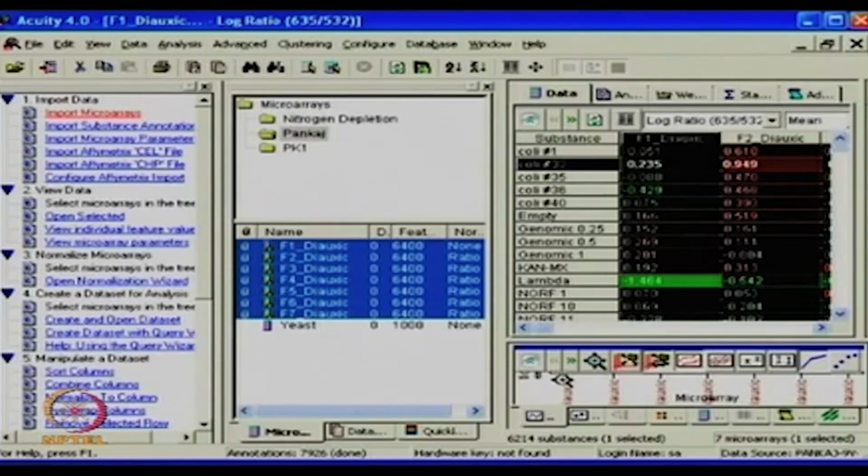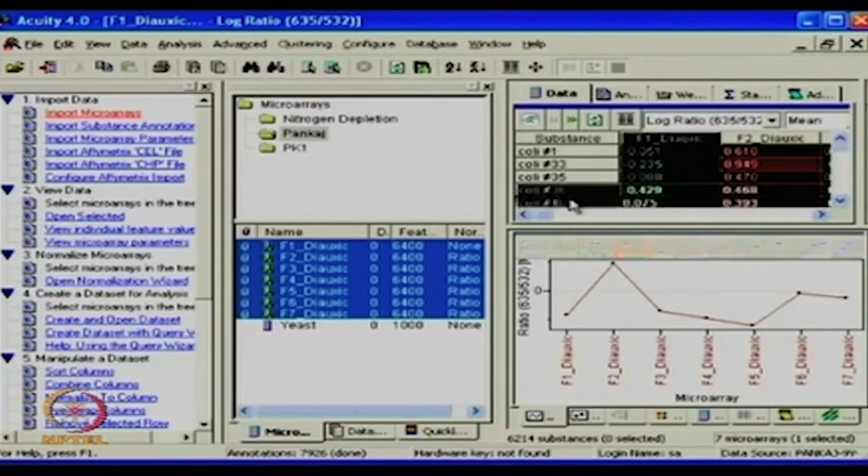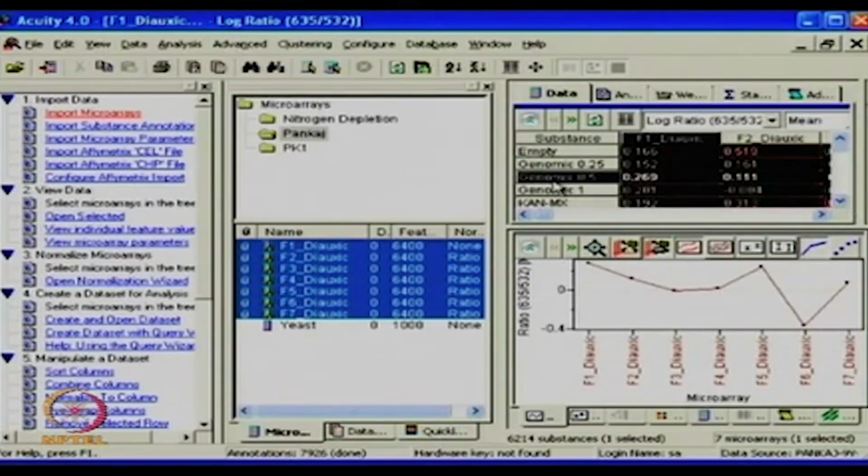So down here, if I just click on the profile button, based on what I have selected, I can look at the different profiles, how it has behaved. In this fashion, immediately I know my parameter file, what each one is, and I see that okay, this is all normal averaged. In one of the cases, it went up. So similarly, different features can be individually analyzed and then checked for how the behavior is. So you can actually look at the trend for the same gene during the whole time course analysis. Correct. So you can also trace a little bit of working on the data.